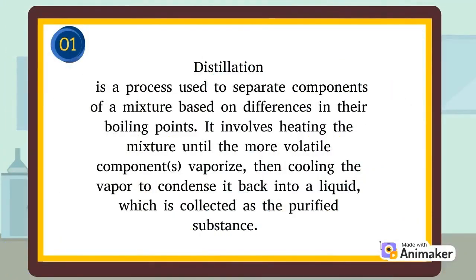Distillation is a process used to separate components of a mixture based on differences in their boiling points. It involves heating the mixture until the more volatile components evaporate, then cooling the vapor to condense it back into a liquid, which is collected as the purified substance.